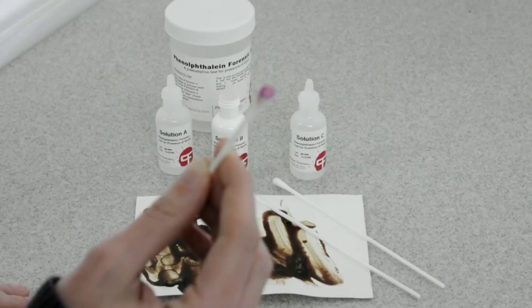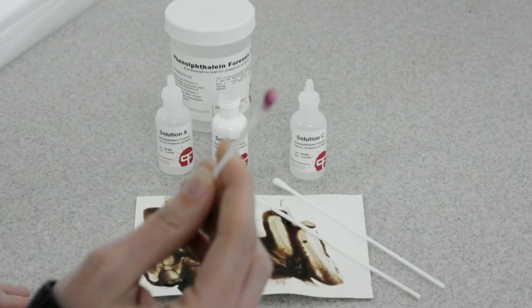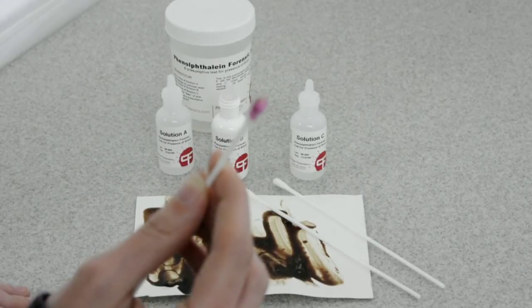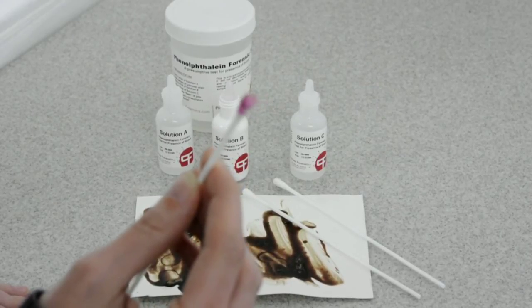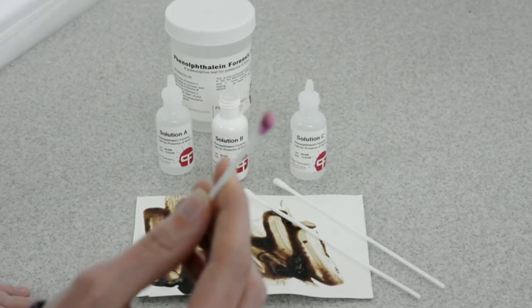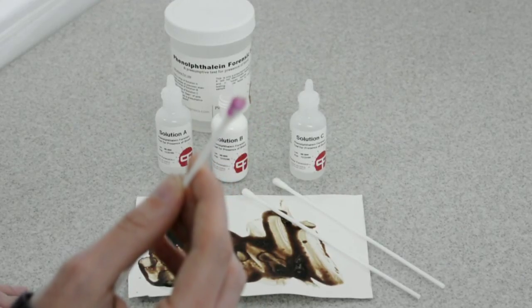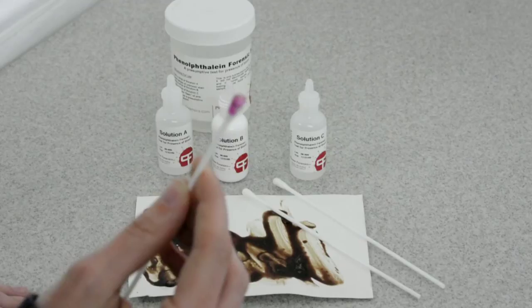The phenolphthalein test is a presumptive test. It should be followed with additional blood tests for confirmation of blood. Although highly reliable, it is only a presumptive test.